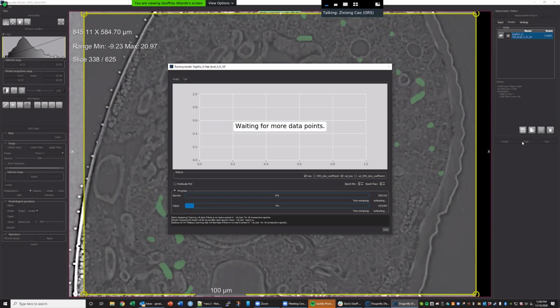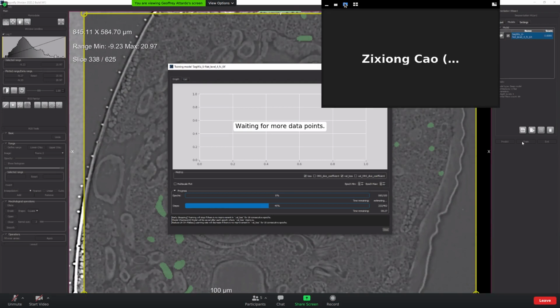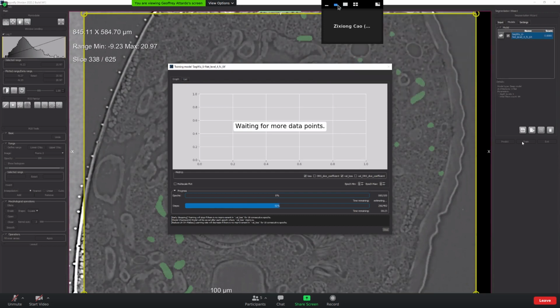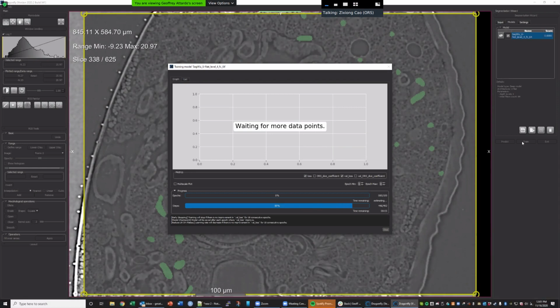So you see in this version 2020.2, we see a curve showing how the loss function is changing. Normally it's decreasing after every epoch. Now every epoch is taking about 1 minute. We expect to see something after 10 epochs, so we let it go about 10 minutes. Let's just wait until 2 epochs are finished.